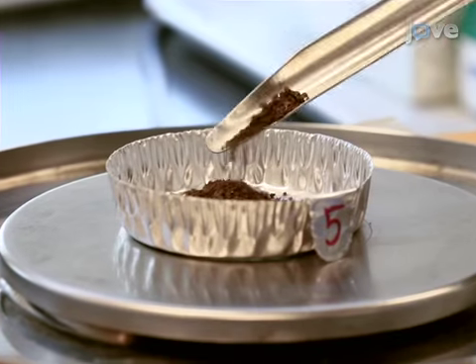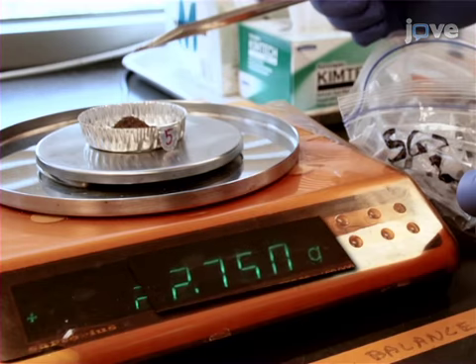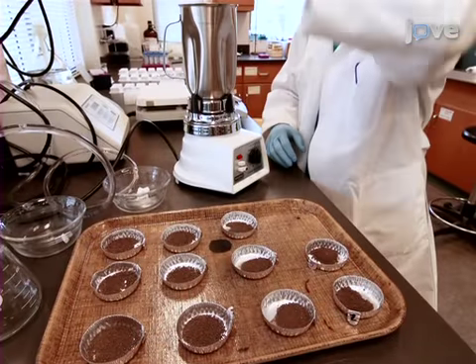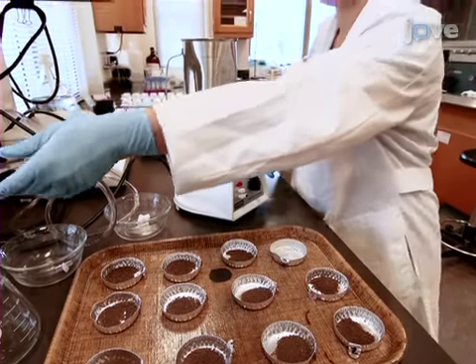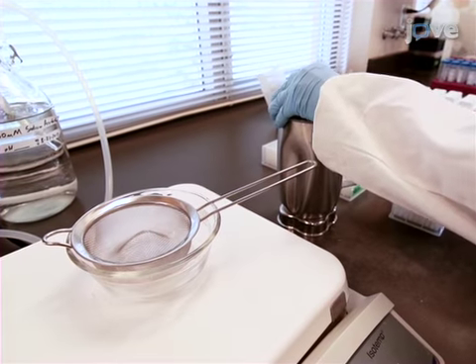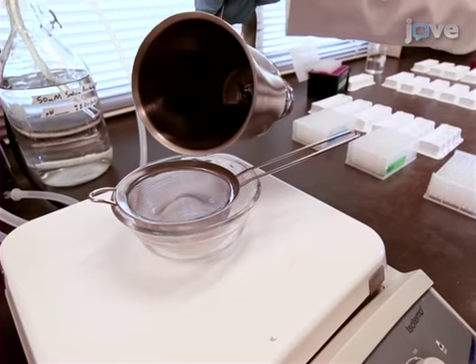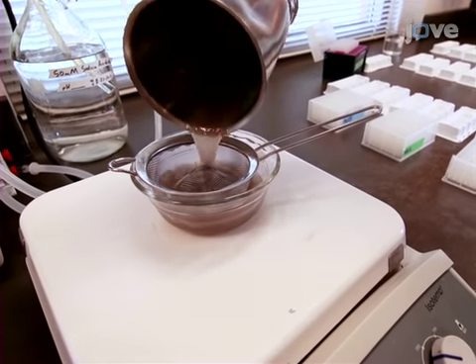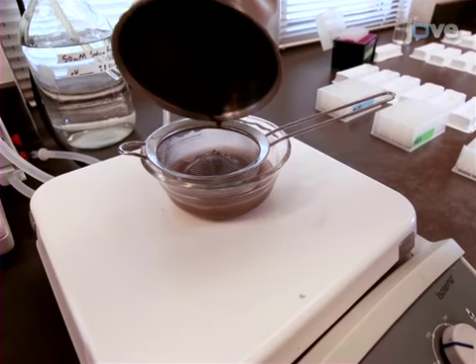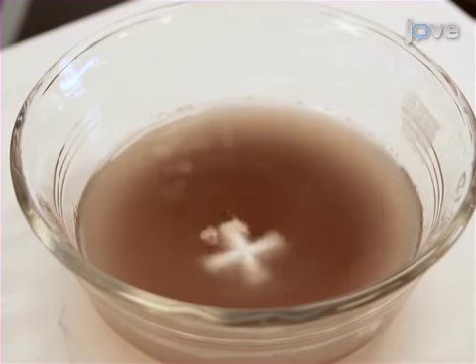To prep soil slurries for each soil sample, weigh 2.75 grams of field moist soil before adding to a blender. Add 91 milliliters of 50 millimolar buffer. Blend on high for 1 minute. Pour the blender contents into a clean glass bowl at least as wide as an 8-channel pipette with a stir bar. Soil slurry may be sieved through an about 1 millimeter strainer before pouring into the bowl. Place the bowl on a stir plate and mix the soil slurry.